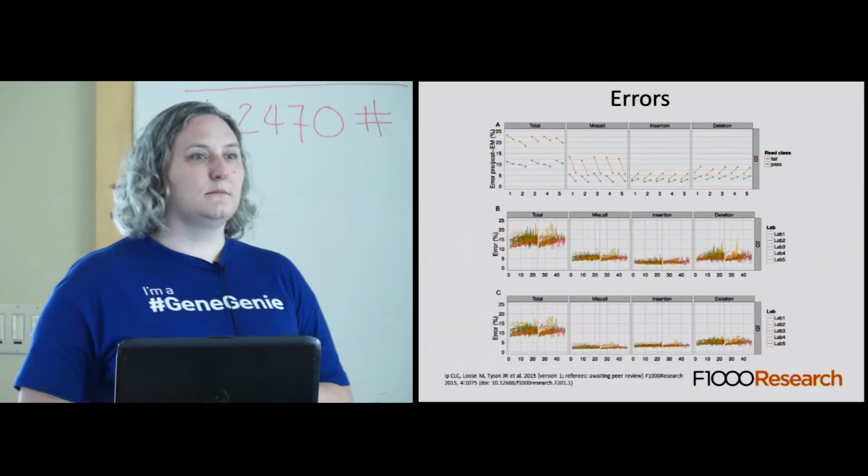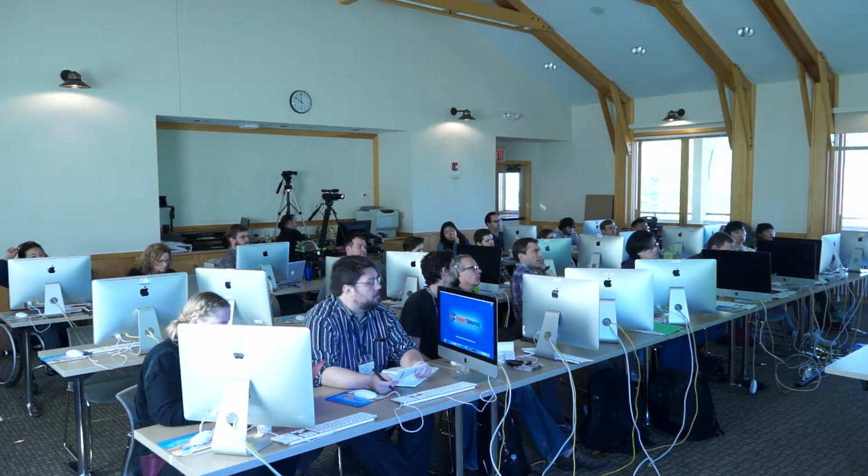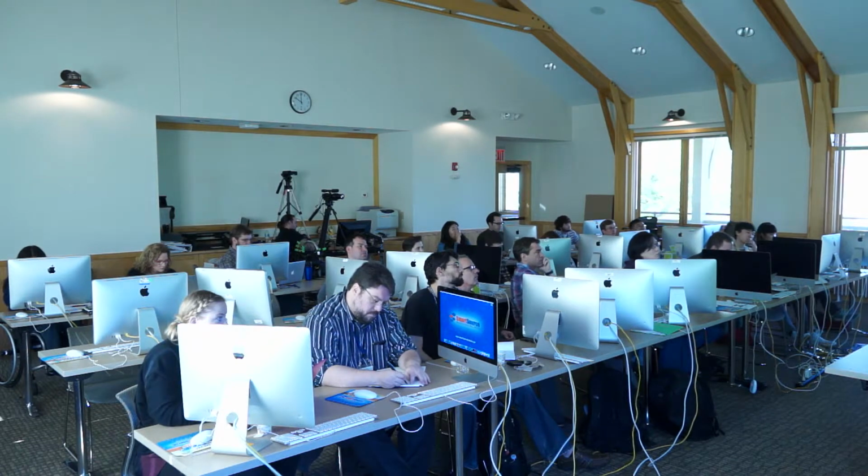And when you say 5%, you mean 5% of all bases are wrong? Bases called, 5% are wrong. Yes, it's not reads or anything. Yes, it's bases. Now, there's some stuff on reads. We'll get to that later.